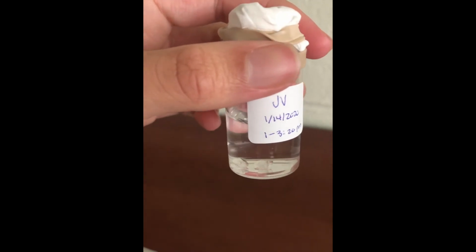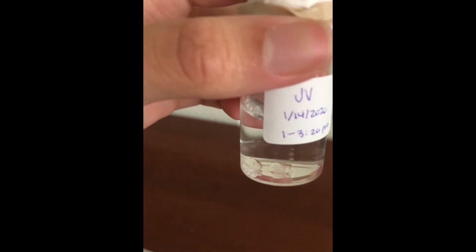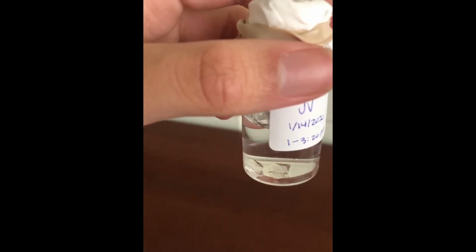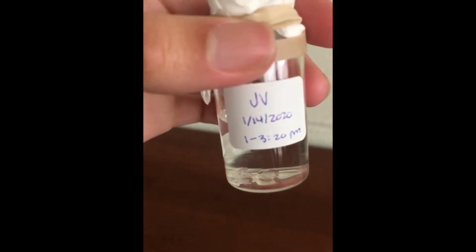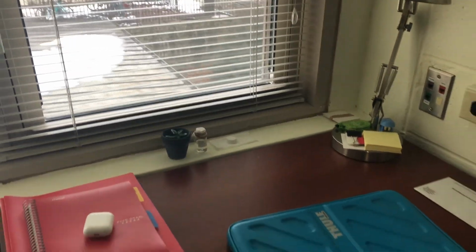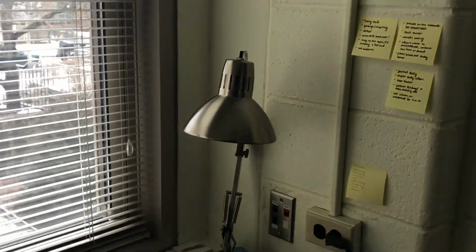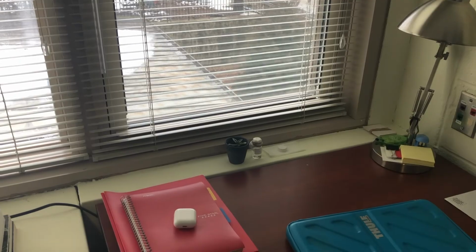All that being said, these are what the crystals look like this week. I've been able to grow 2 good-sized crystals, and I think this has something to do with where the alum solution is actually sitting in my room. It's been sitting on my windowsill, soaking up the sun, as well as the light from my desk lamp at night, which may be helping the solvent evaporate faster and therefore help the crystals grow faster.